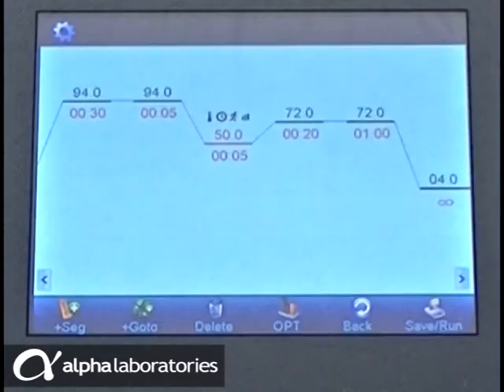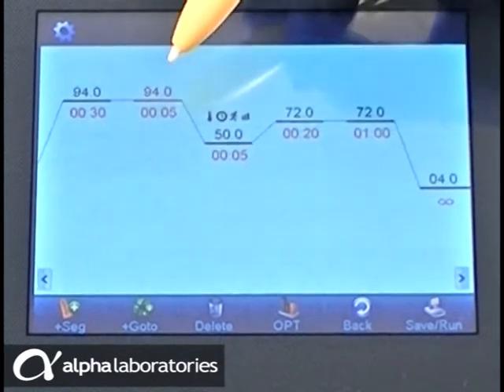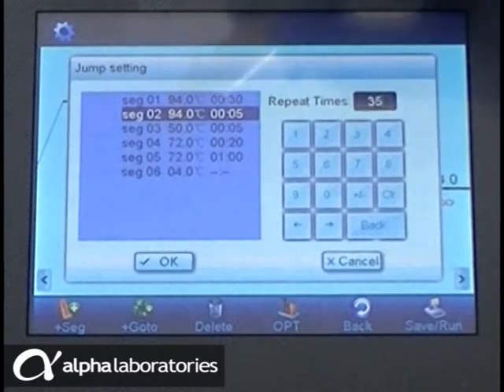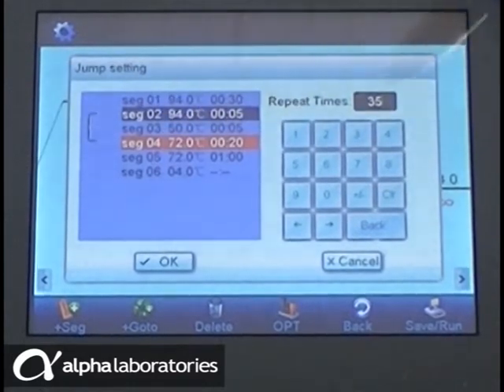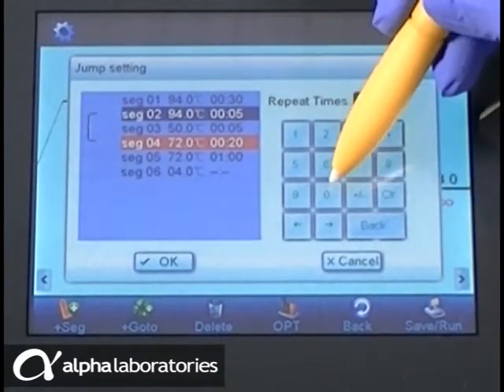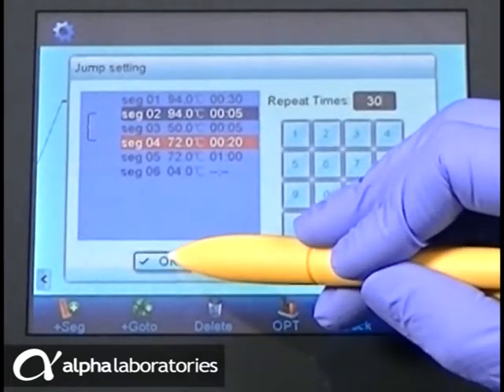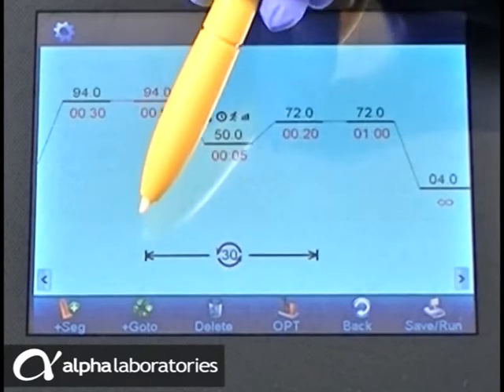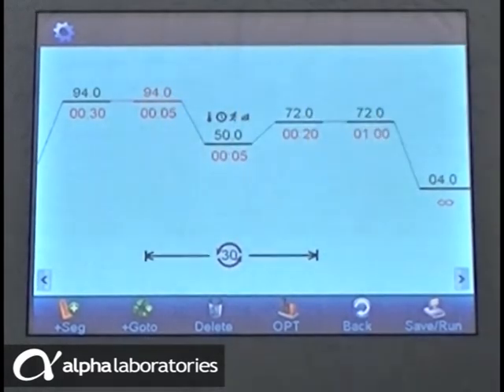To input the number of cycles to run, select the first temperature segment to be cycled and touch Go To. Select the final segment to be cycled and enter the number of repeat times. Touch OK. The number of cycles is now displayed. The maximum number of cycles is 99, making it suitable for nested PCR protocols. And it is possible to add more than one set of repeat cycles into a program.